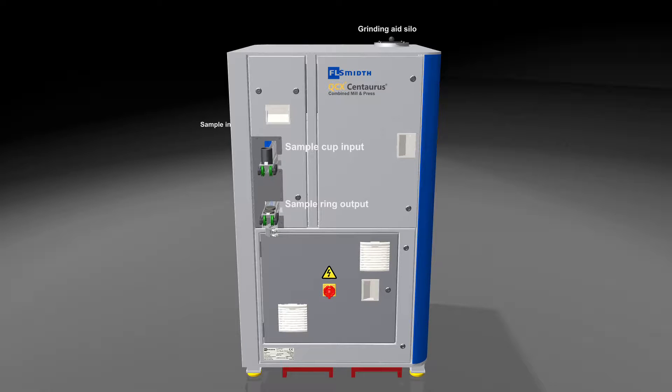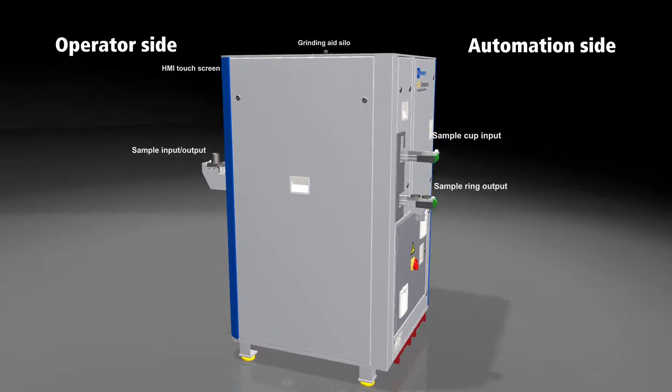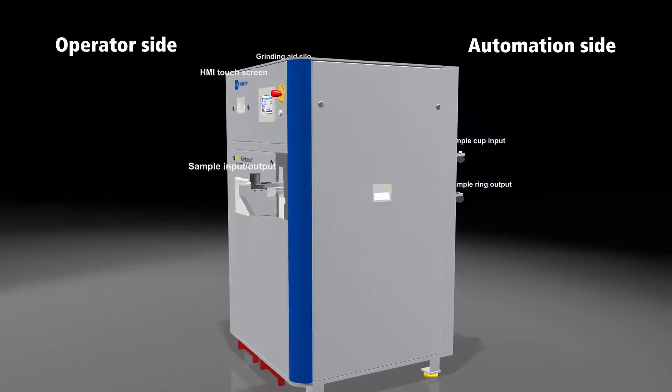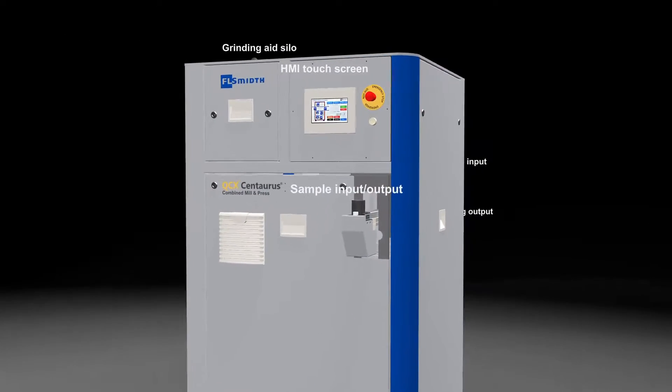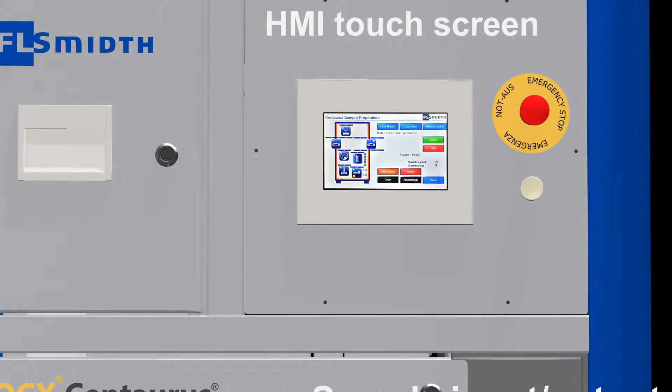The Centaurus has two dedicated sides: an operator side and an automation side. The automation side has two belts that feed rings and cups in and out. It can be configured to meet any semi or fully automated lab configuration orientation.